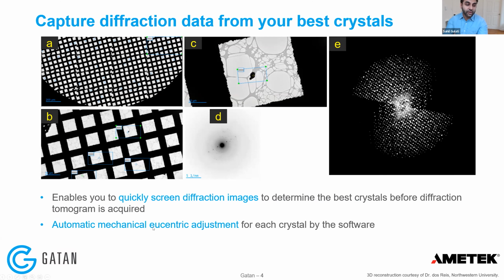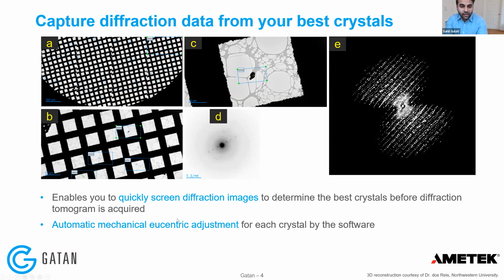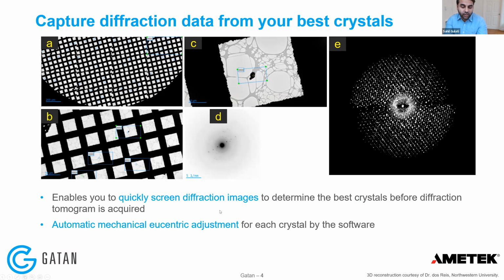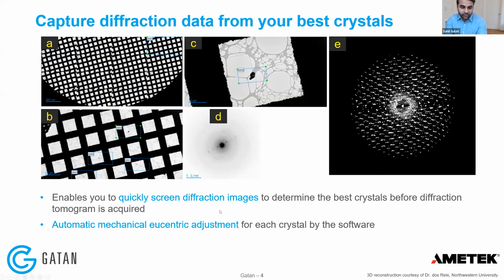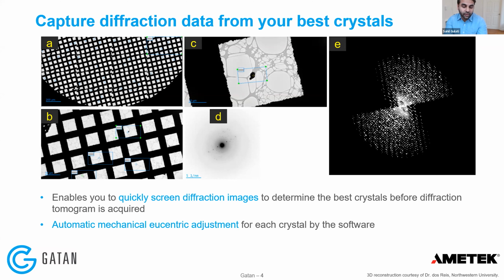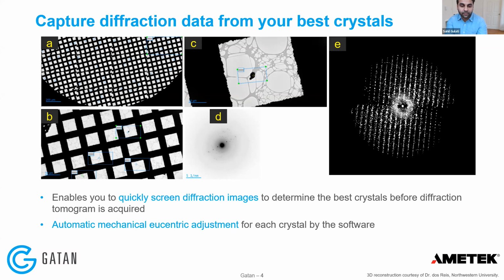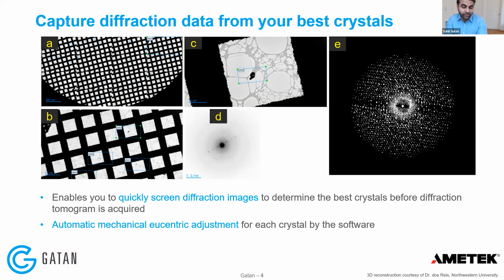And finally, you have the opportunity to do automatic mechanical eucentric height adjustment on every crystal, because you would like to make sure that once you target a crystal and you tilt the stage, the crystal remains in the field of view, so that the diffraction quality of the tilt series that you get is at par and exactly what you want at the end of the day.